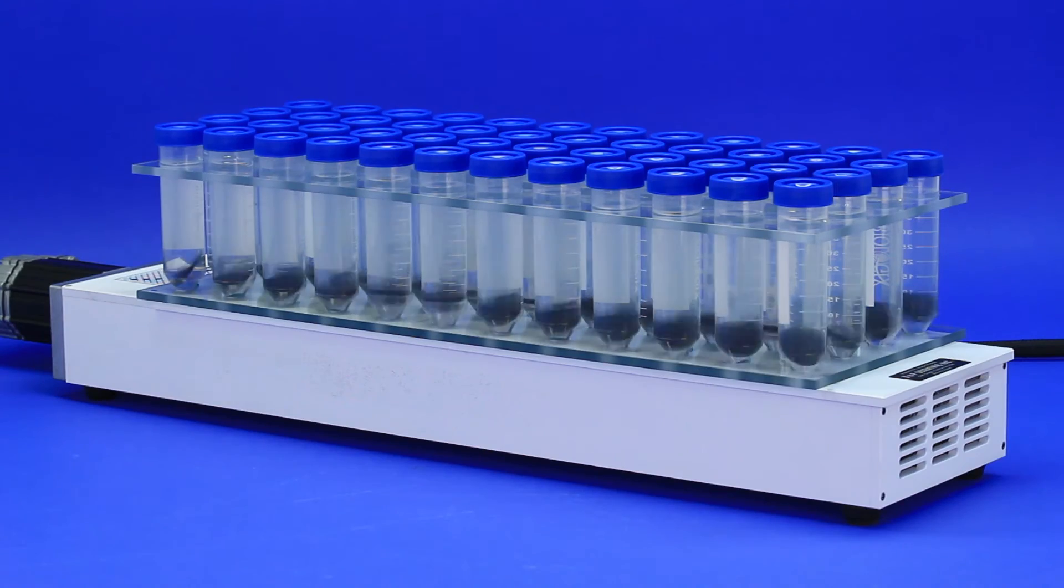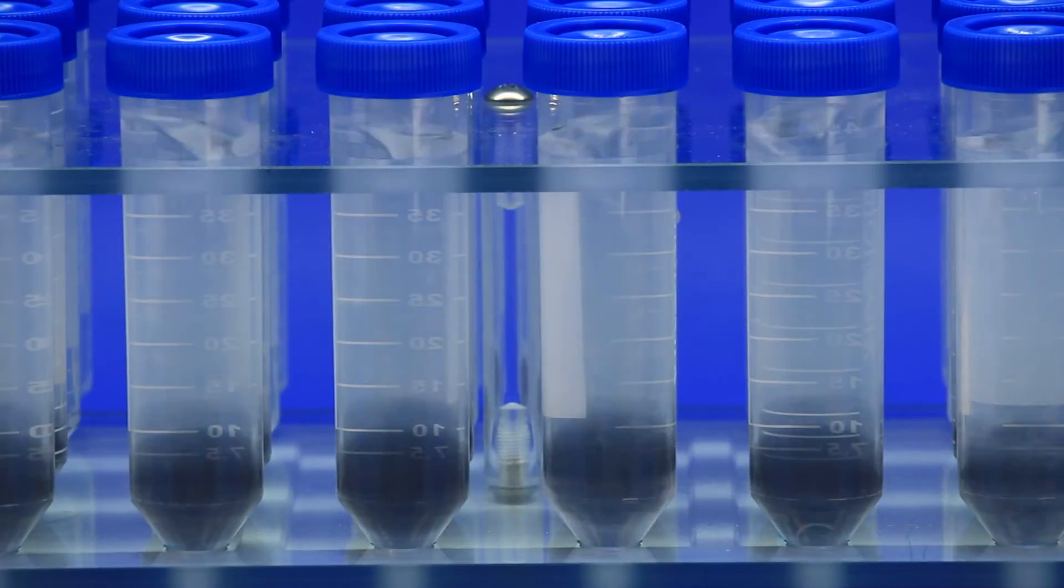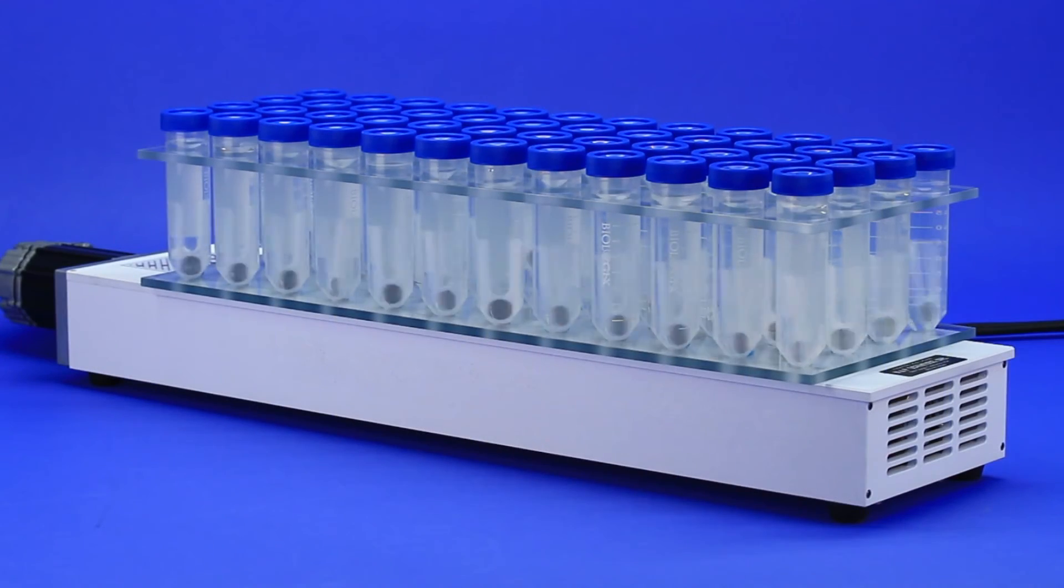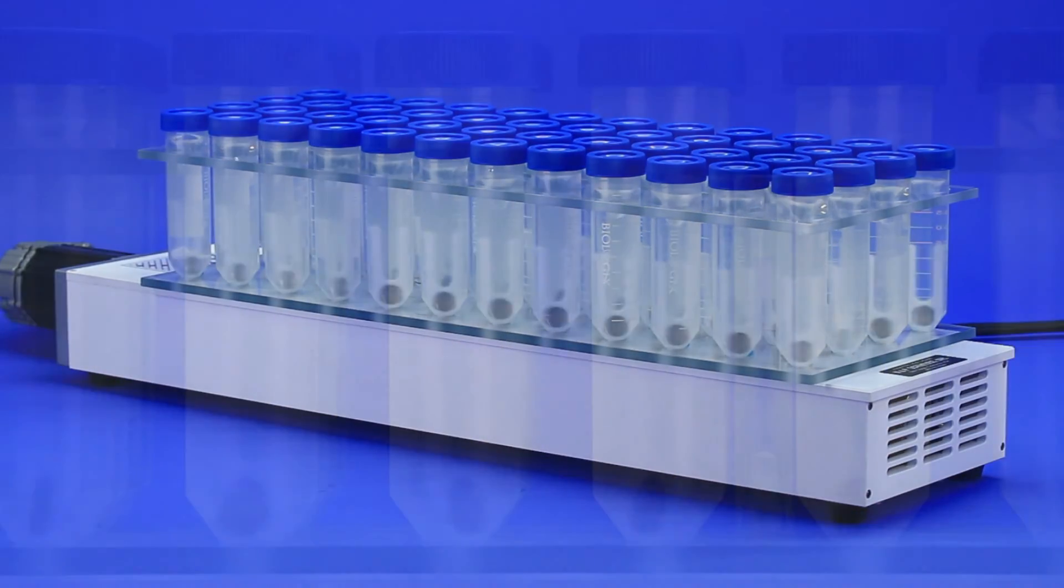Here we demonstrate vortex mixing in 50mL tubes on top of a magnetic tumble stirrer, first with a magnetic disc and then with one of V&P's unique tuning fork magnetic stir elements.